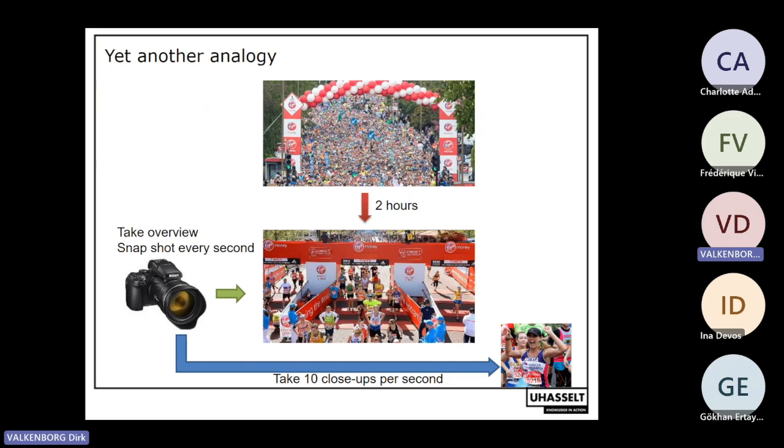So these things can happen also in a mass spectrometer. It's not necessarily so that if a peptide is present, you also select the peptide for fragmentation. Or if you select the peptide for fragmentation, it could be already gone, resulting in a bad fragmentation spectrum.